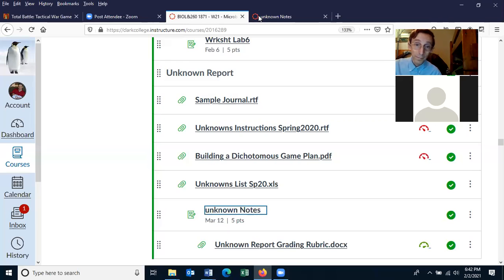And this report, meaning the sample, starts out where he's got 2 species, and he's streaking it out for isolating it and then purifying it, and then using one species to write up his report. And you're not going to do that, because I'm only going to give you one species. So the beginning of this you can kind of ignore, because you're not doing that work. But the rest of it you are doing. Any questions about that? All right, that's an example for what your journal should look like.